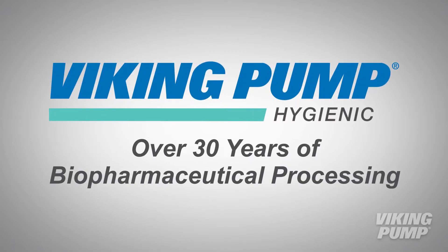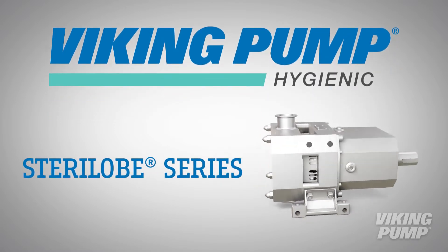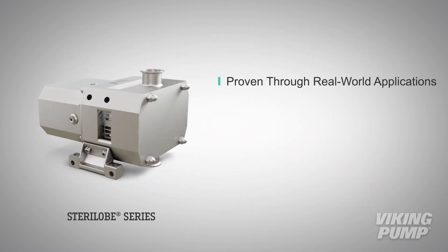Viking Pump has over 30 years of experience in biopharmaceutical processing, and the Sterilob Series Rotary Lobe Pump is the first choice for these biopharmaceutical processes. The Sterilob Series has been proven and validated through real-world applications in the most demanding processes since its release nearly 20 years ago.